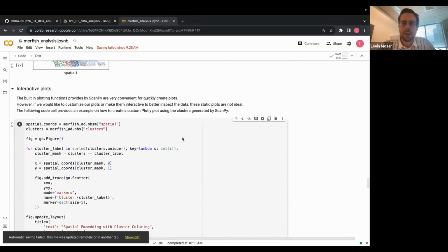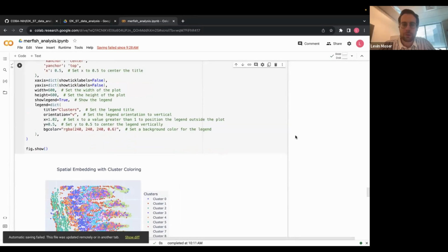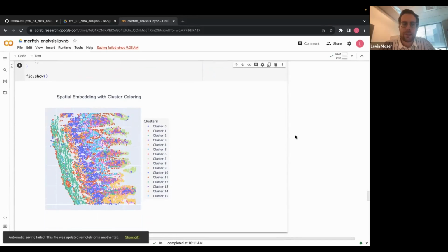And so now let's go a little bit further, and let's try to understand a little bit more about these clusters. These clusters, or this image, is essentially also the reason why you want to do spatial transcriptomics. This is the difference to single cell sequencing.